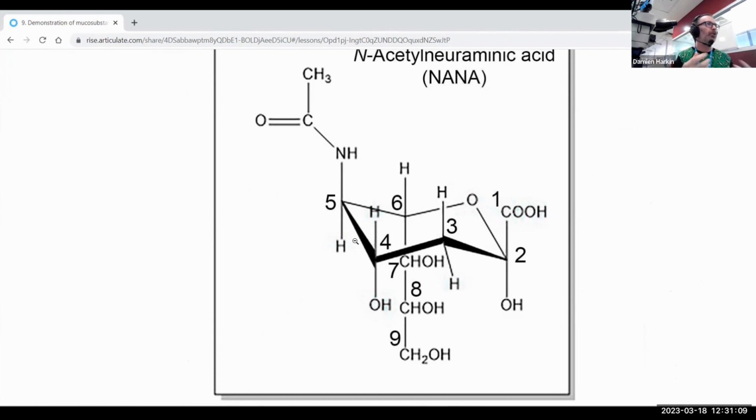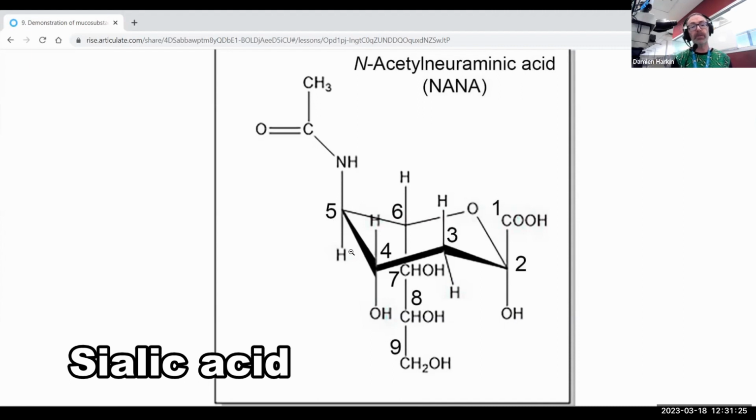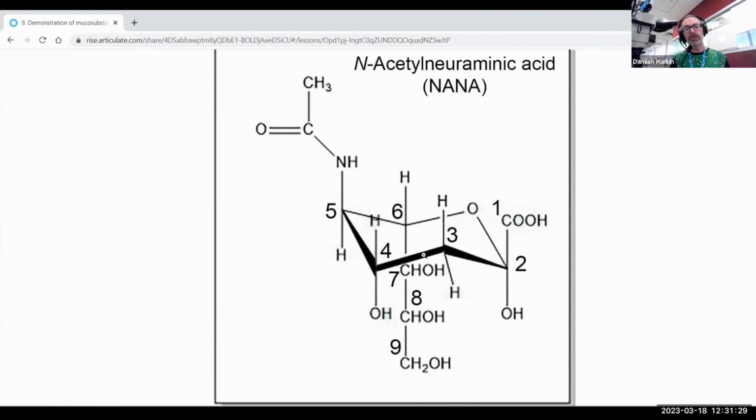We'll be able to apply this terminology a lot more freely when referring to various structures that we can see down the microscope. So this final structure is an example of a sialic acid. Again, it's just another type of saccharide. We can see the typical ring-like structure of carbon and oxygen, but the arrangement of side groups is far more complex. This has a mixture of chemistries. If you look, first of all, to try to find the presence of adjoining hydroxyl groups, we note that within the saccharide ring structure, there are none to be found if you look closely.